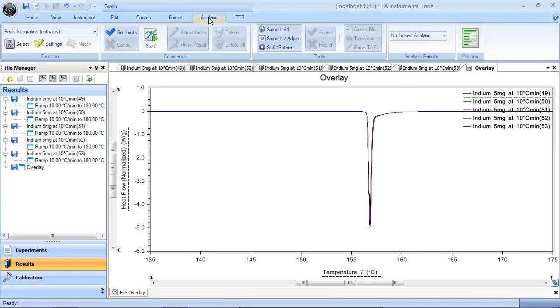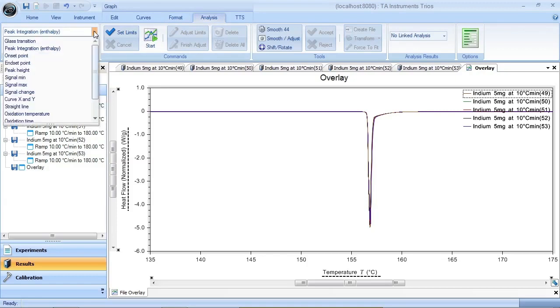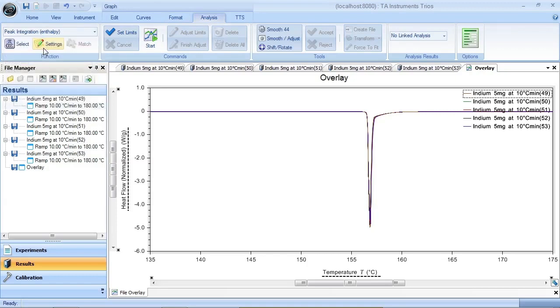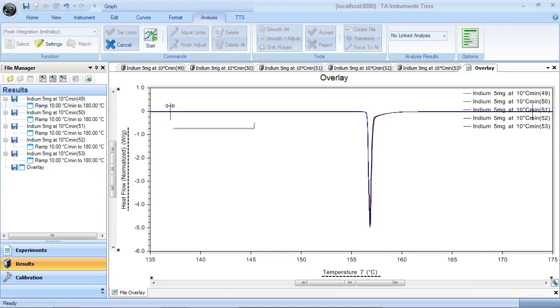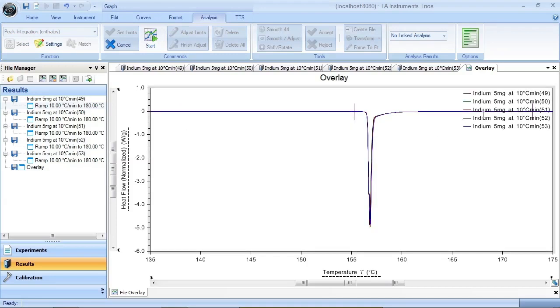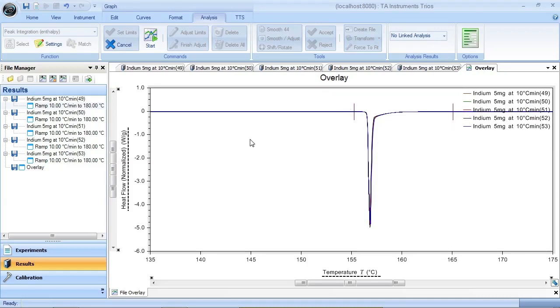So now I'm going to go to my analysis ribbon. I'm going to select Peak Integration Enthalpy and say Select Limits. So now I've got my limits here. I can move my cursors wherever I want. I'm going to move it to right about there and right about there. So I like that spot. Now I'm going to just right click and say Accept Limits.